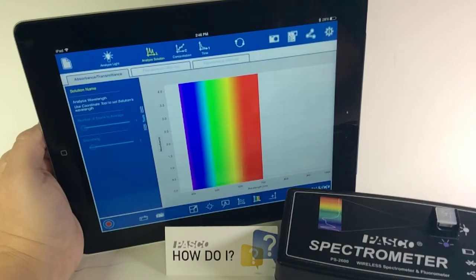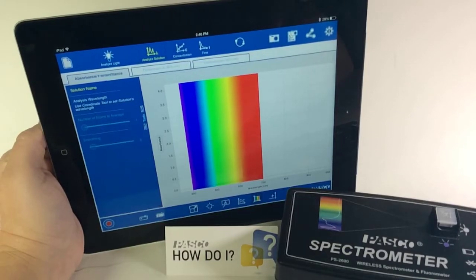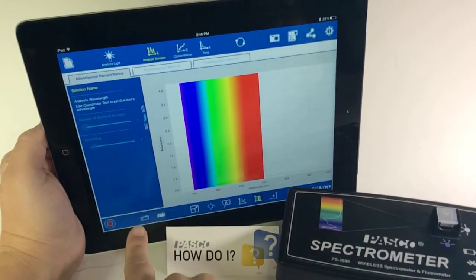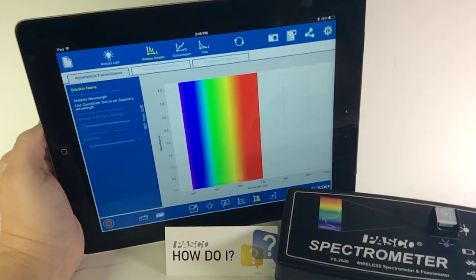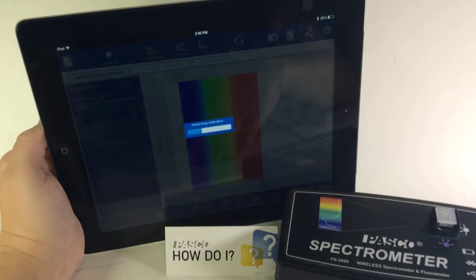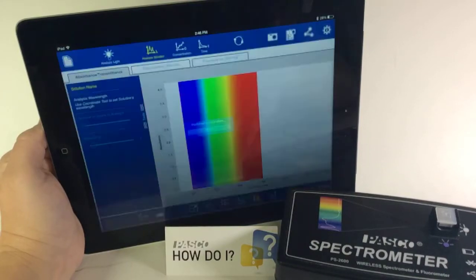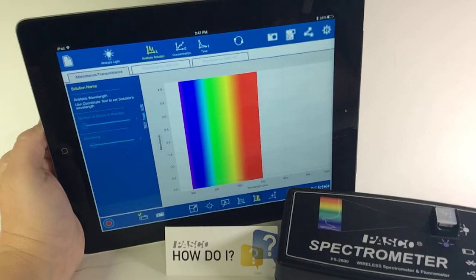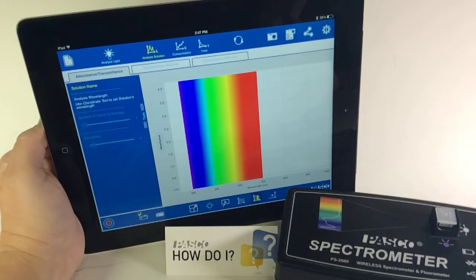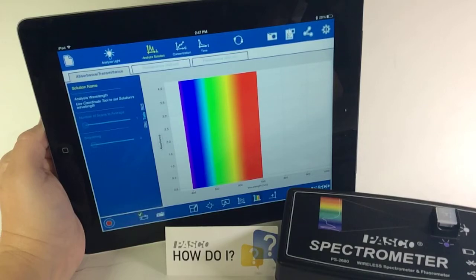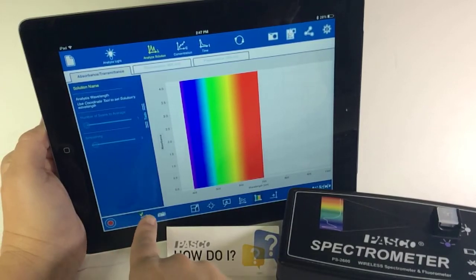I'm going to first Calibrate Dark and press the button. It's performing the calibration, which at this time the light inside of the spectrometer is turned off and it's adjusting for any ambient light.